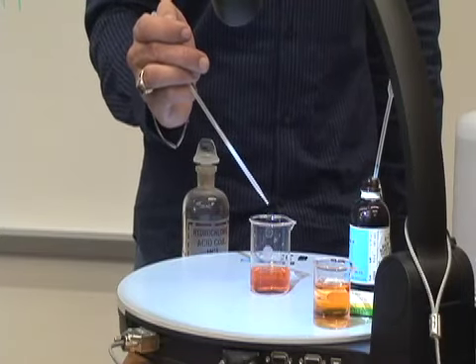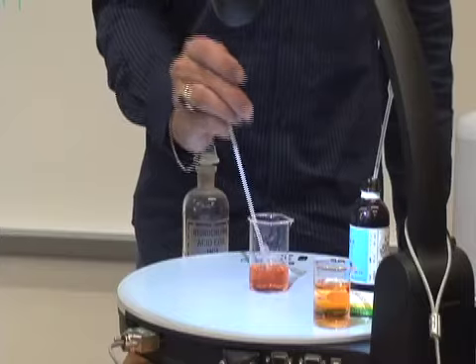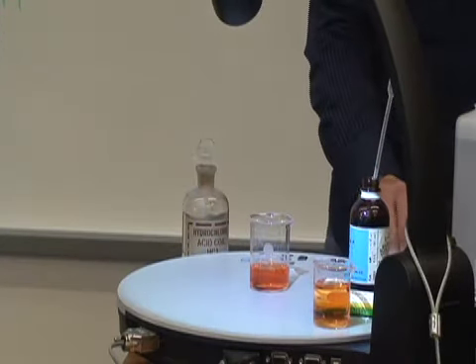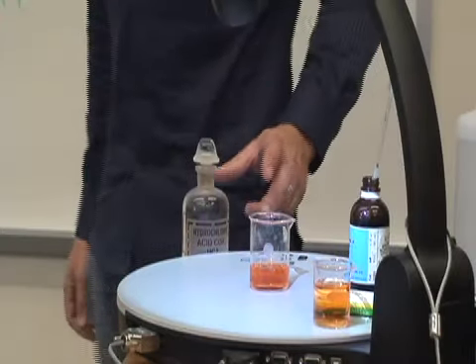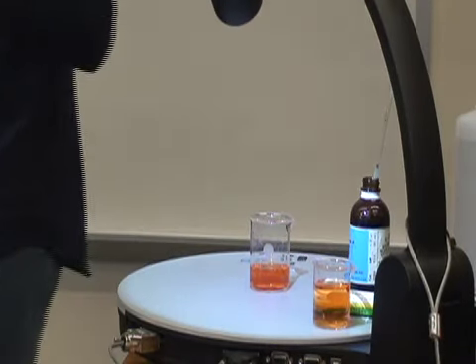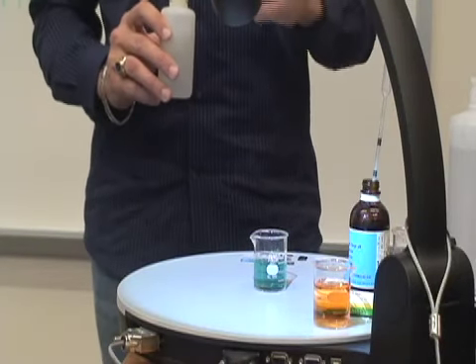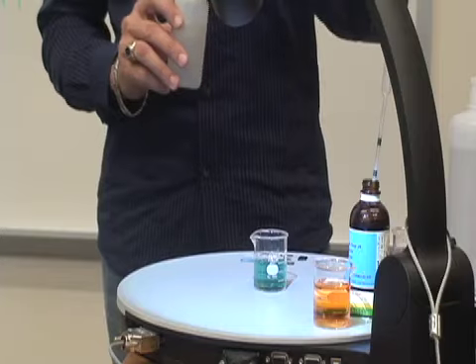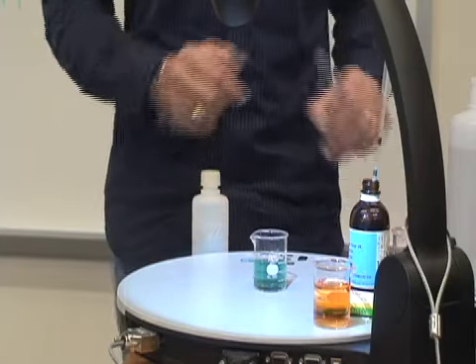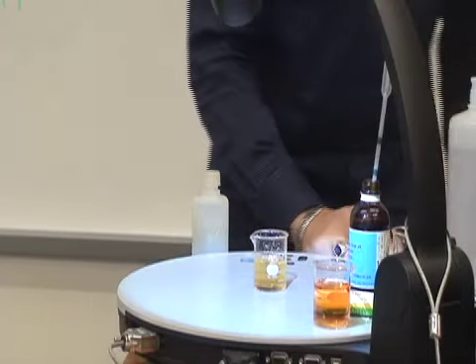Add another drop. That's interesting enough. That would make sense because what? Hydrochloric acid is a strong acid. Many of these things were cleaned with basic soap. So what do you think about that? Yeah, it's still in there. But probably not very much because watch. There, neutral.